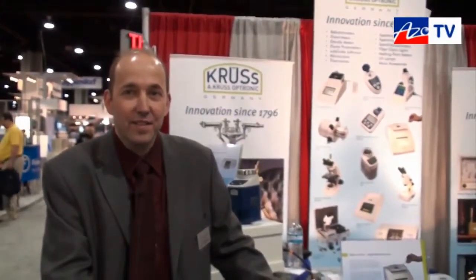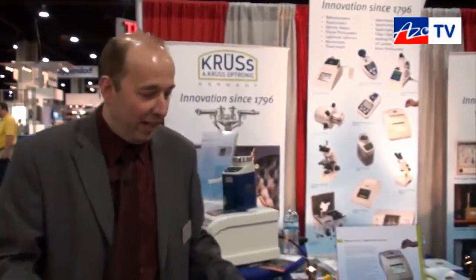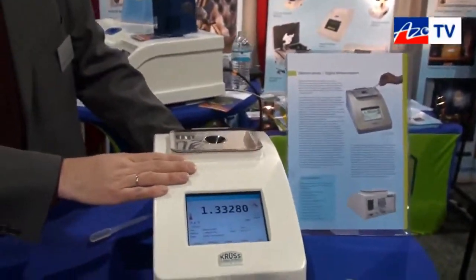Welcome to this episode of AZoTV. Today I'm speaking to Stefan Wecker from Krüss, and he's going to tell us about their DR6000 digital refractometer. This is our DR6000 refractometer.